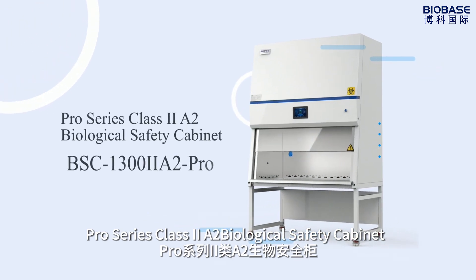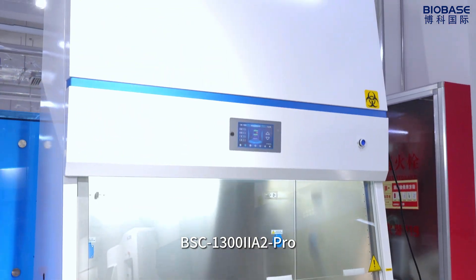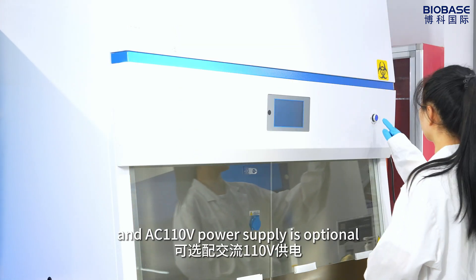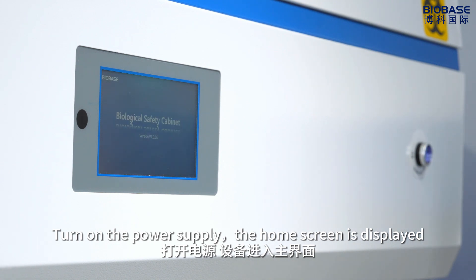Pro Series Class II A2 Biological Safety Cabinet BSC-1300IIA2-Pro. Firstly, connect AC 220V power supply; AC 110V power supply is optional. Turn on the power supply — the home screen is displayed.